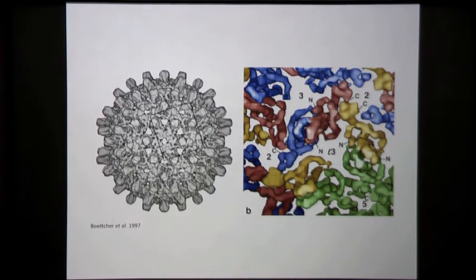So using those kind of techniques, Bettina and I calculated a map of the core of hepatitis B, which is icosahedral, but has 4 independent subunits, blue, red, yellow, and green here, in the asymmetric unit of the icosahedral shell. And we were delighted when we found that each of the 4 density distributions looked very similar.